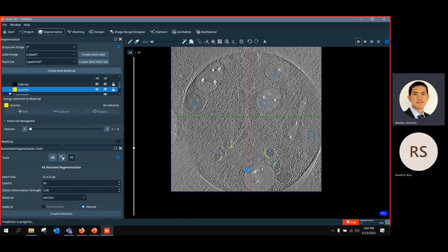Let's take a look. I didn't prepare the drawing very well, with just 4 slices to give you a rough idea. You can see now it tries to detect part of this membrane. Maybe the patch size that I selected is not good enough, because it also detects this mitochondrial membrane and some part of the microtubule. But at least you can imagine how this works.